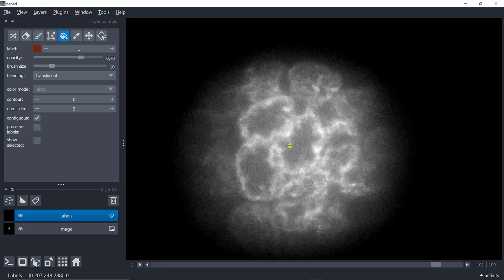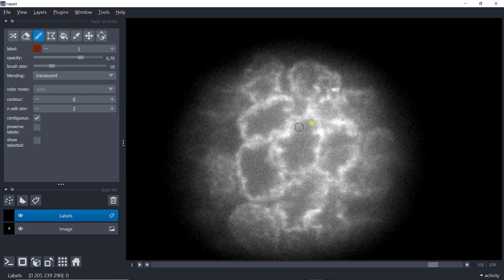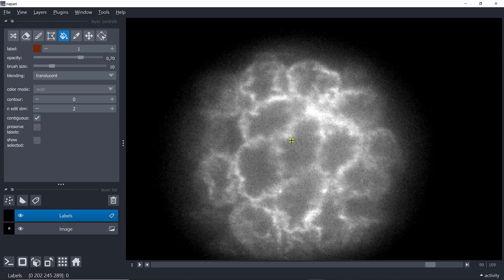And next. As you can see, the problem with 3D data is that quickly it becomes quite cumbersome to do. But we'll see that we can use other tools to try to decrease the time required, to go a little bit faster. Okay, I'm going to do this.